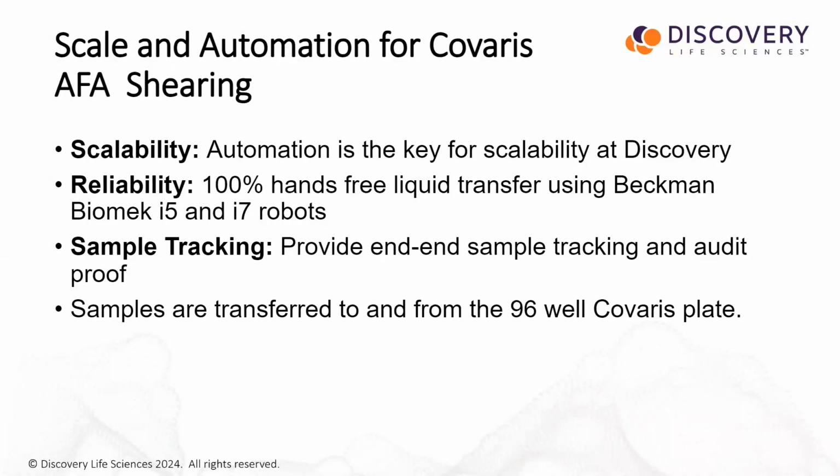As far as scalability and sample transfer and tracking goes, I think Covaris has done a very great job by addressing it with a new R230 instrument, which can be directly integrated into a liquid handler like an i5 and i7. The TPX plates improved liquid handling and can be used throughout the first bead cleanup. So you don't necessarily have to transfer your samples. You can normalize samples in the same plate, take it into shearing, take it out, and straight away goes into end repair, A-tailing, and ligation.